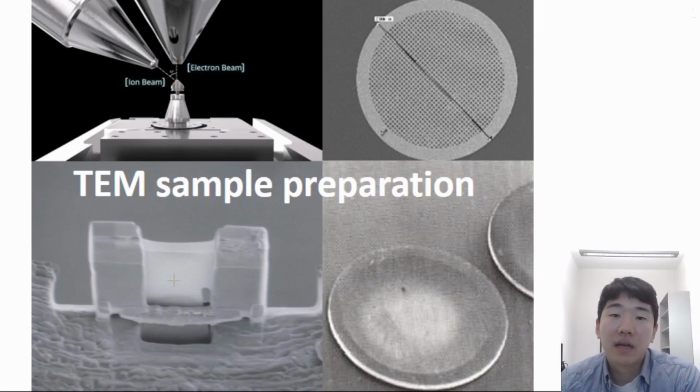TEM experiment. The quality of your data will be directly proportional to the quality of your specimen, and even the efficiency and reliability of your produced data strongly depends on the quality of the sample as well. So it is always better to know as many solutions or ways of sample preparation as possible when you want to do TEM. You can also call this a recipe for TEM sample preparation, and today I'm going to introduce it to you.